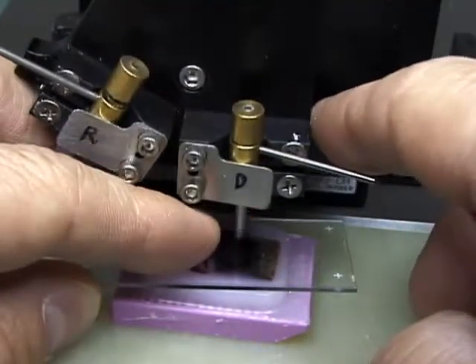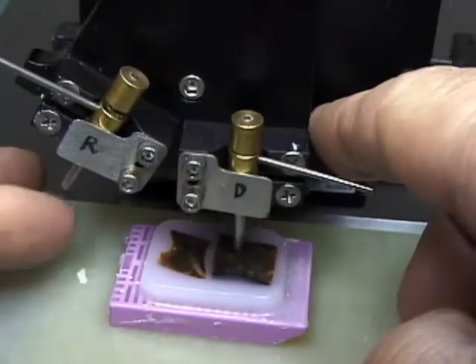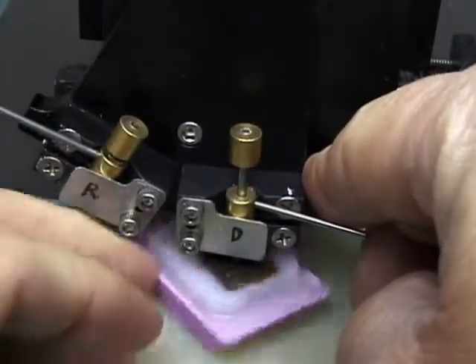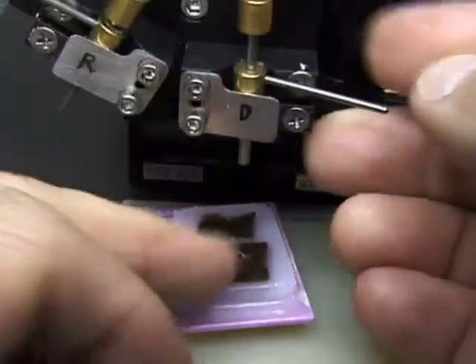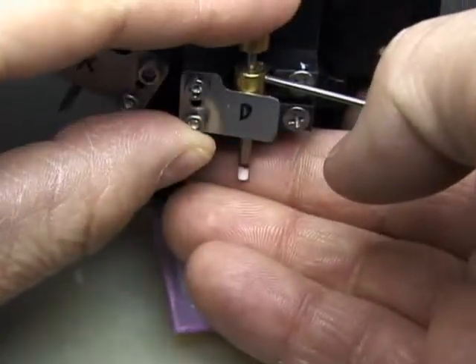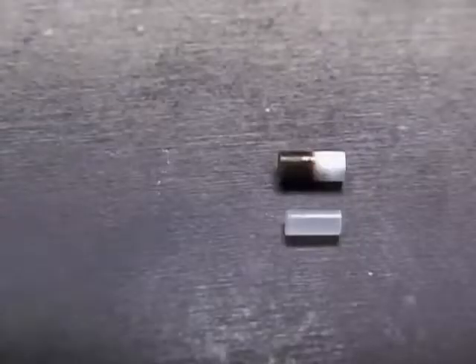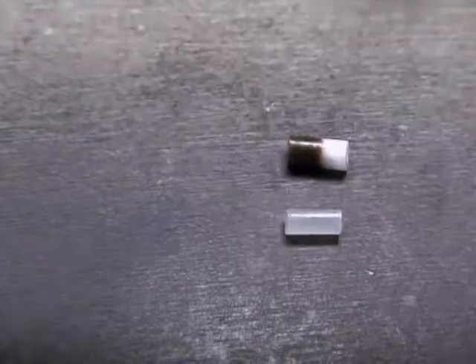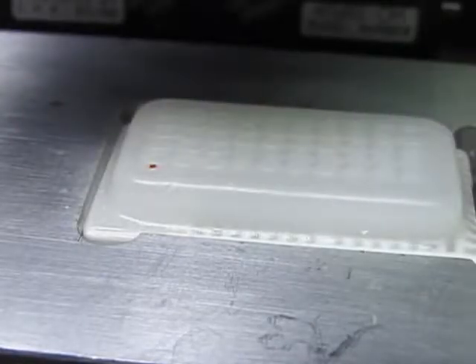When punching donor tissues, you will notice some resistance because of the size of the needle and the density of the tissue being punched. This is normal. Because there is not a depth stop for punching donor tissues, the length may be longer than the array holes. Donor cores need to be trimmed to size. Remove the core from the donor needle and lay it next to a blank paraffin core punch. Trim the donor core, matching it to the length of the recipient core.